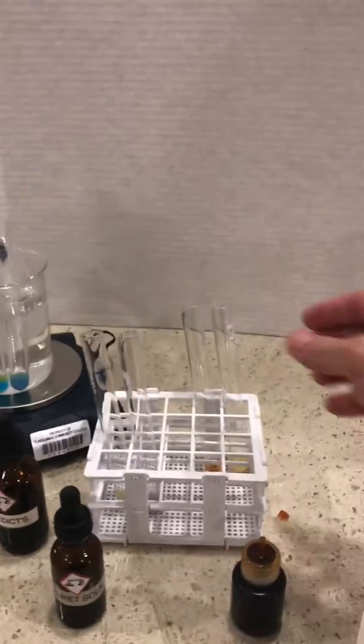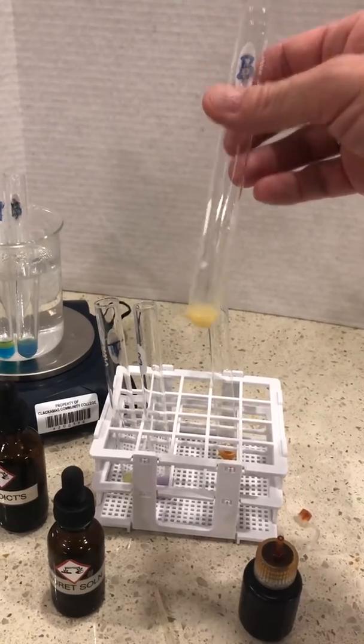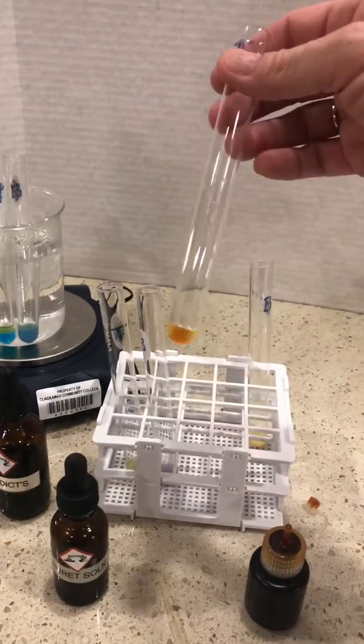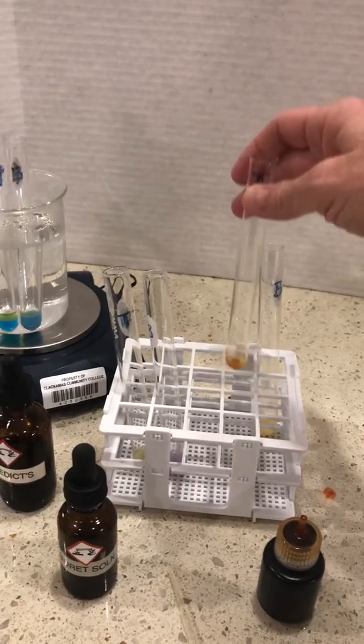Here are the final results. The iodine test: the bottom, note its color, and the top layer, note its color, and again add these to table 2.2.